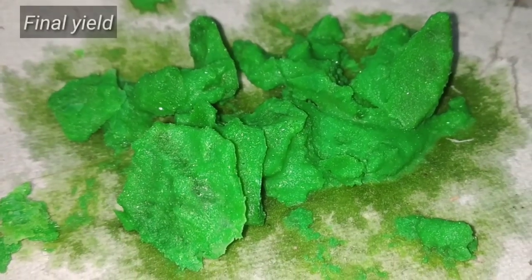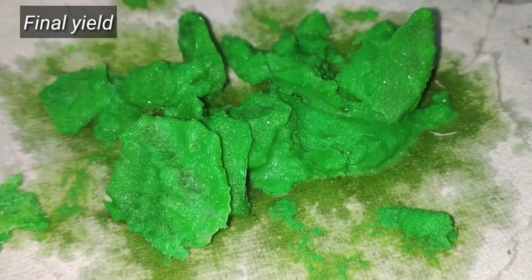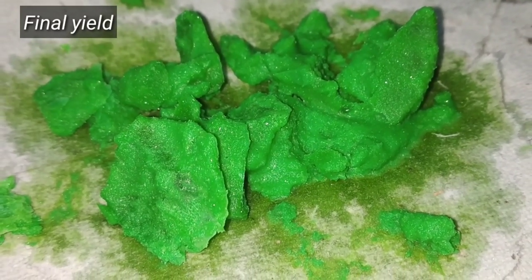After all the water has evaporated, we are finally left with this green colored solid, and this is the copper 2 chloride.